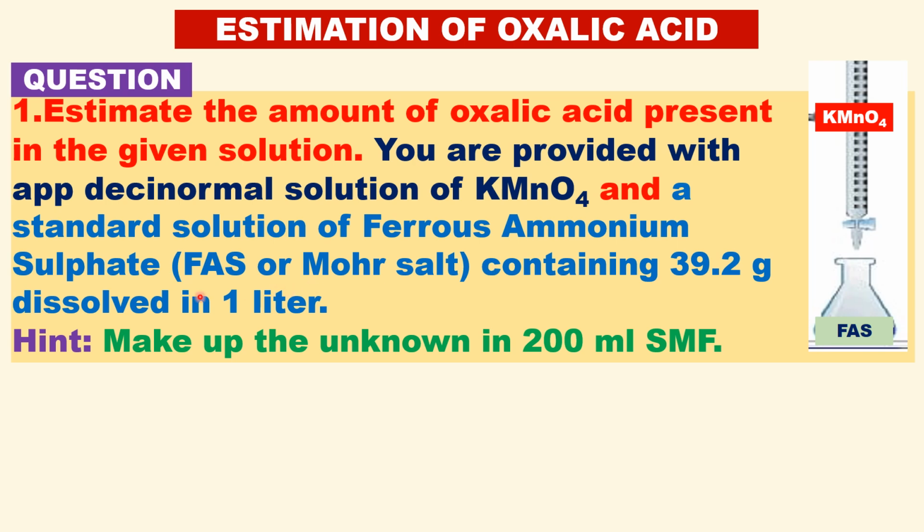Ferrous ammonium sulfate is a standard solution. You will be given two bottles, one KMnO4 and another ferrous ammonium sulfate solution.